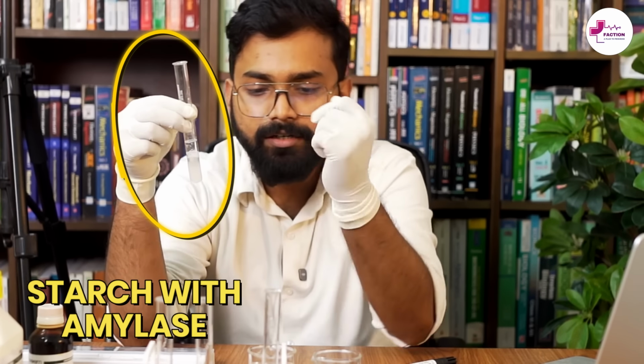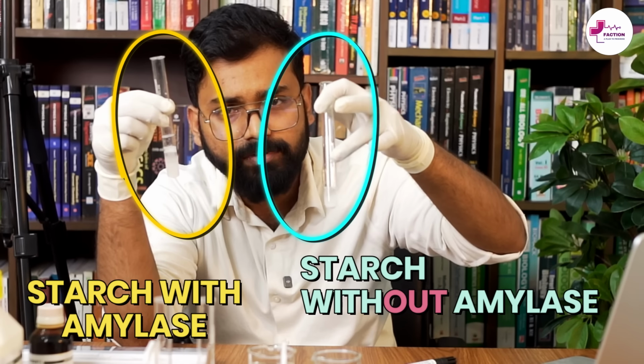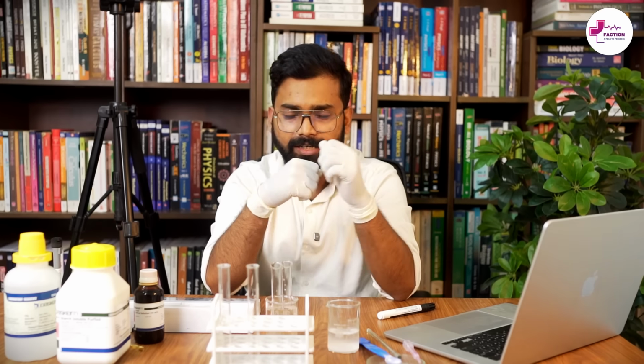Say this is the test tube in which amylase is present and amylase will gradually digest this starch. Whereas in this test tube we will not take any amylase, so starch will remain intact and we will leave it as such for some time. So I guess it's 15 minutes, we are done. Now we will add iodine in both of these test tubes.